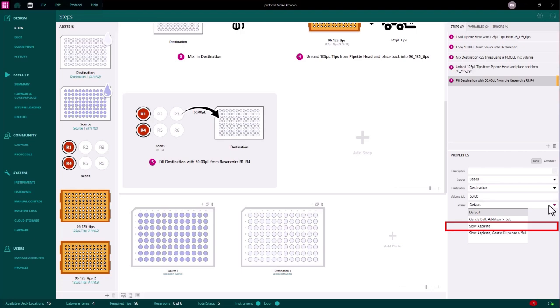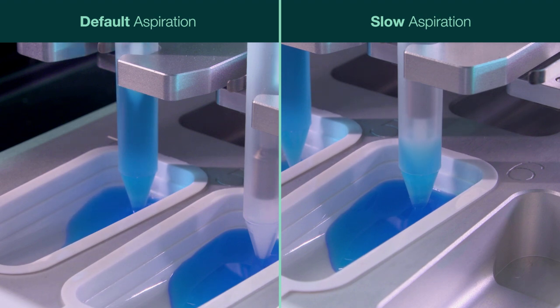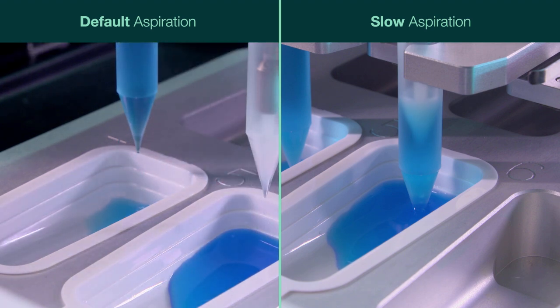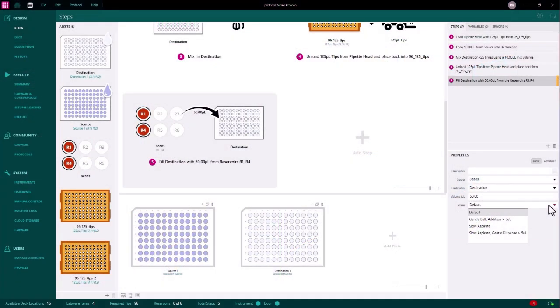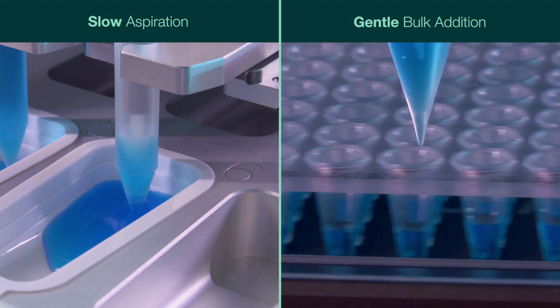This can be useful with a very viscous liquid. Preset 3. Slow aspirate and gentle dispense over 5 microliters. This applies the changes of both gentle bulk addition over 5 microliters and the slow aspirate preset.